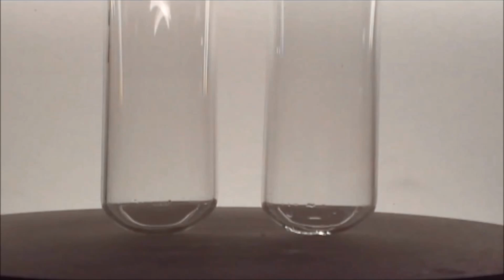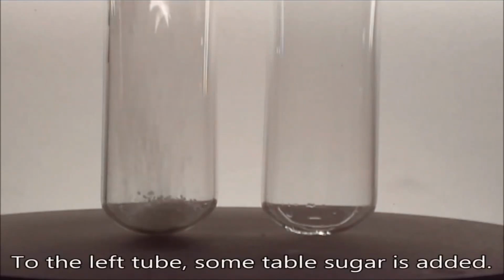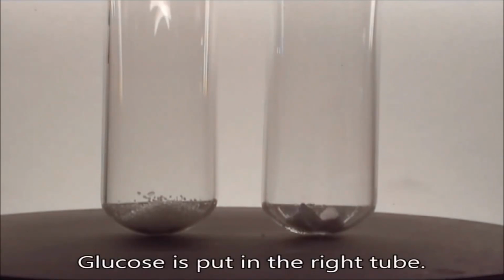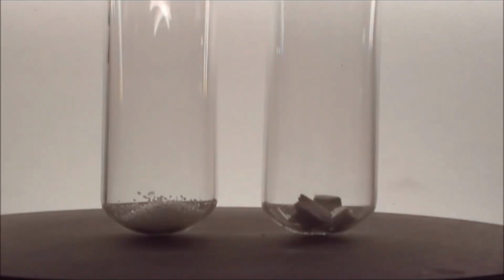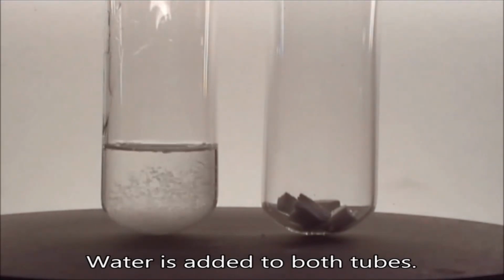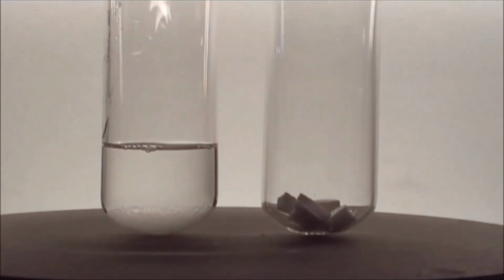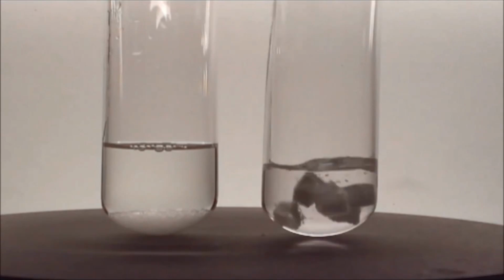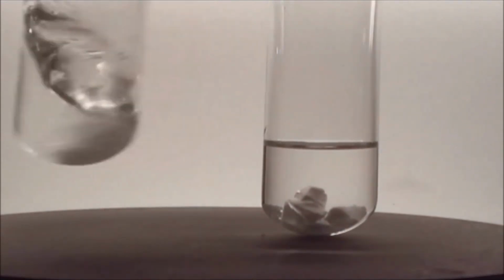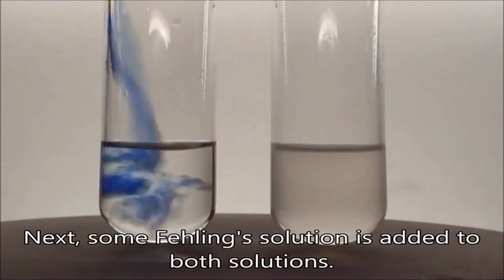Let's watch this video. To the left tube, some table sugar is added. Table sugar contains sucrose, not glucose. In the other tube, on the right side, we put glucose. We're supposed to add water to dissolve the sugar we added first. We shake the tubes and then we add Fehling solution.